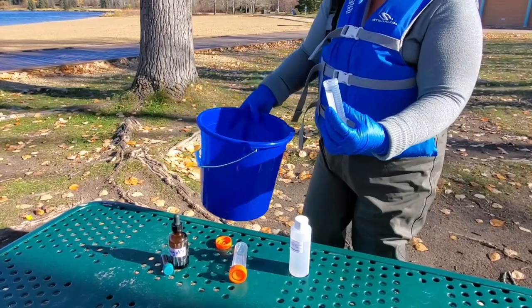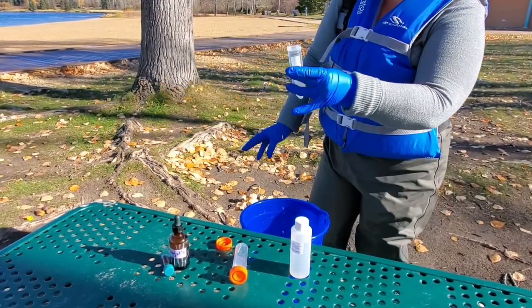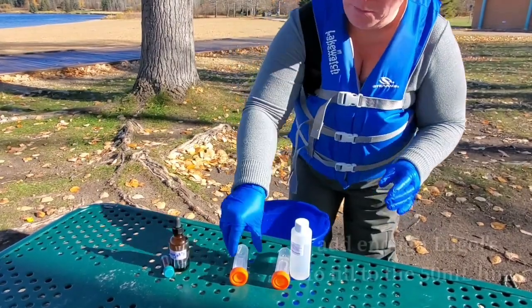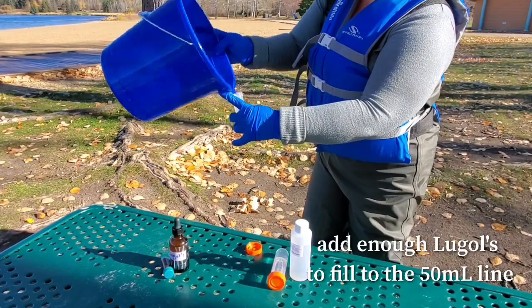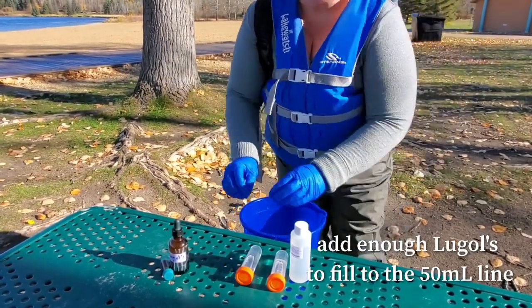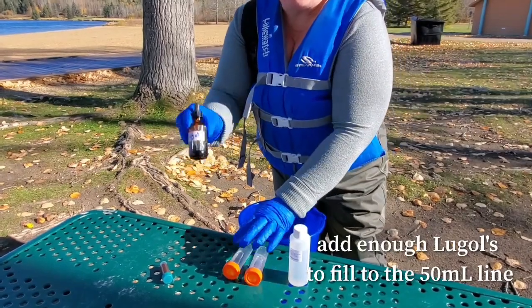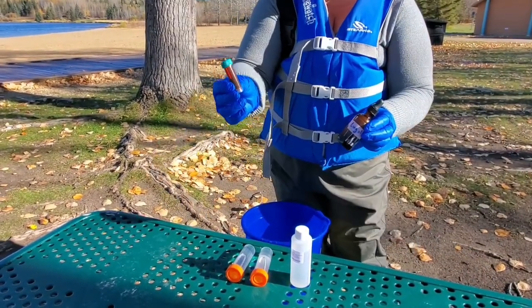Fill the other 2 orange cap tubes up to about the 48-49 milliliter line and add 1 to 2 milliliters of Lugol solution. This is approximately 1 stopper full if you are using the vial, but you can also use pre-measured amounts. Be sure to avoid tightening the caps too tight to avoid cracking.